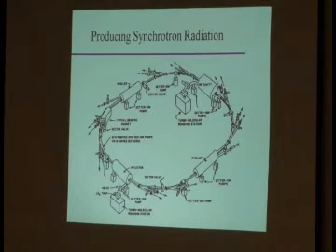So we accelerate the electron, we put energy in, but the electron can't gain kinetic energy. That means the energy has to go somewhere, right? Because we always have to preserve the total energy of a system. Well, what happens is the excess energy is given off as X-ray radiation.